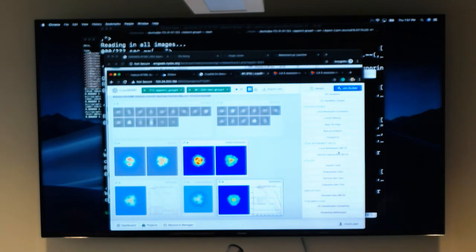Okay. Does anyone have any comments, any questions, anything particular about what they've been seeing here? You are also welcome to process other data. We only have a few data sets within the instances, but that will help expand, like if you ever wanted to go back to micrographs and go through those instead of the particles we've given you, or you want to go back to the particles and do more classification.